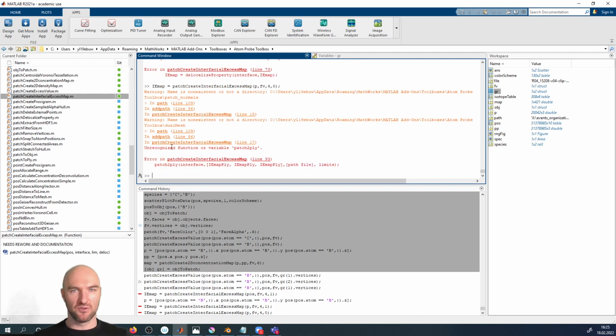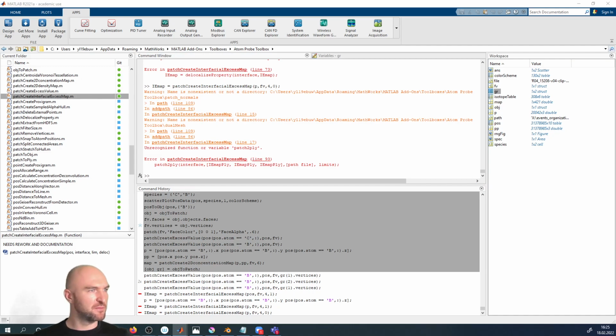And there is no function called patch2ply, because that's called patch2ply, and that function was missing something. Okay, maybe that wasn't tested as thoroughly as it should have been. I apologize for that.